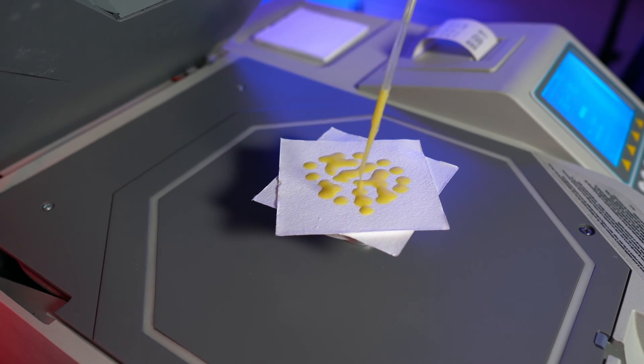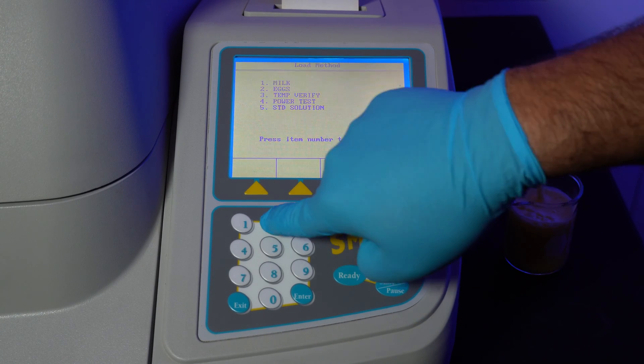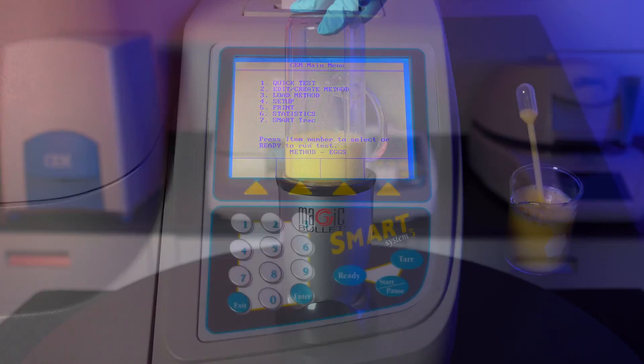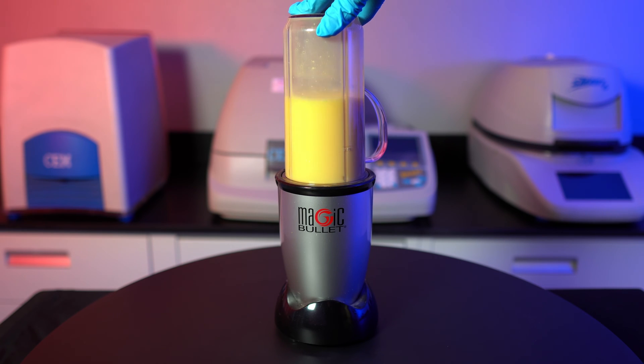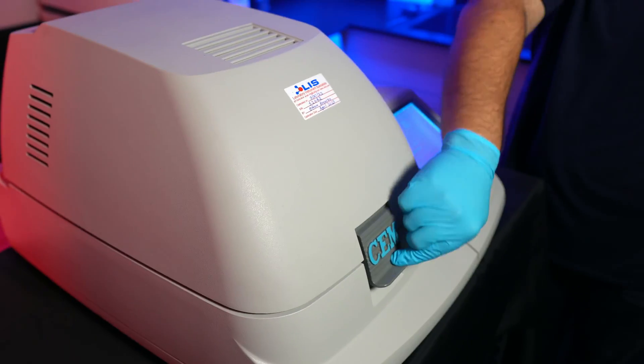The next test will be done on eggs. From the main menu, press 3 for load method. We already created our egg method, so we'll select egg. For this specific test, we need to blend the egg in a blender to ensure the product is completely mixed and will therefore give us the most accurate testing result every time. The steps to testing are the exact same as before.